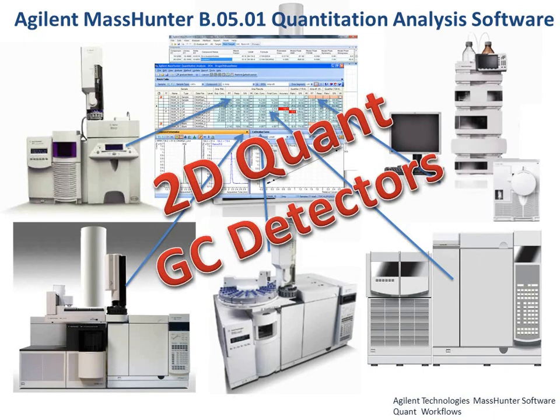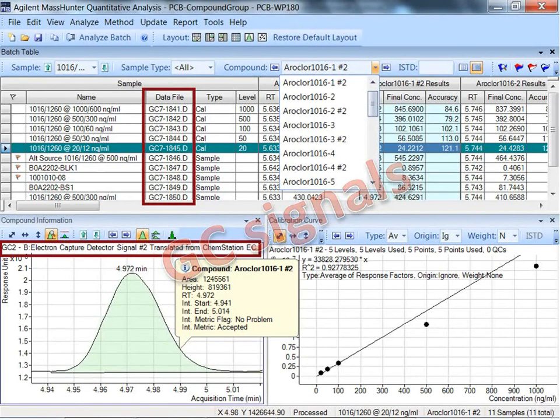So let me show you how we can give you a simplified presentation which will show you those signals, and then I'll walk you through the argument that there's a lot in common with mass spec quantitation, even though you've just got a 2D signal, because when you boil it down, once you've extracted the signal, quantitation is quantitation.